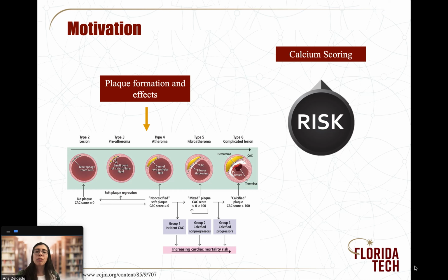As the disease progresses, the lumen area of the artery becomes smaller, and also the arterial elasticity decreases, making it harder for the artery to fulfill its main functions. And the fatal result is a fracture of the tissue, which can lead to lethal consequences. The main purpose of this research is to study the mechanical properties of the calcification in order to provide insight on its mechanical behavior for better treatments of cardiovascular diseases.